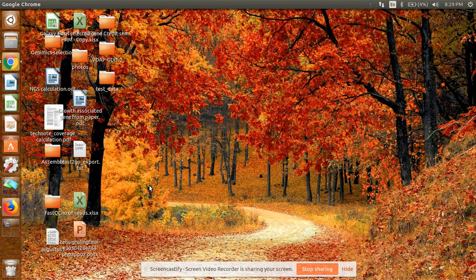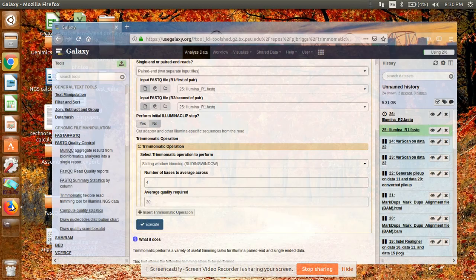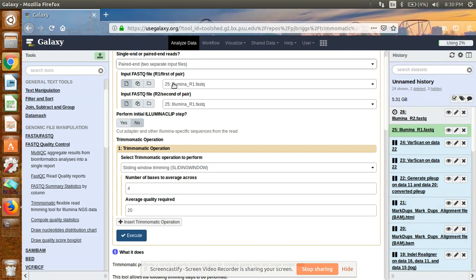Today I am going to discuss how to trim raw sequence data. We will use the tool called Trimmomatic. For that we can use the online server known as Galaxy.